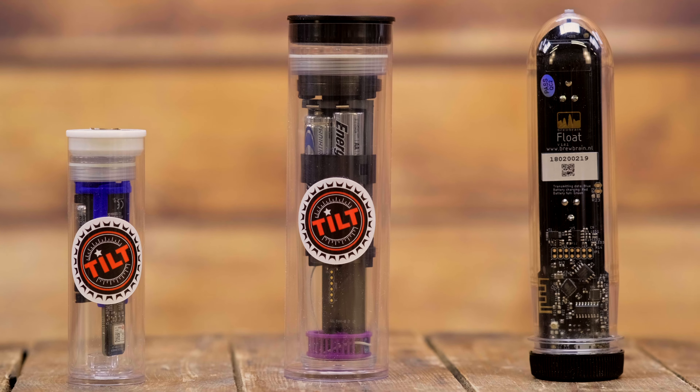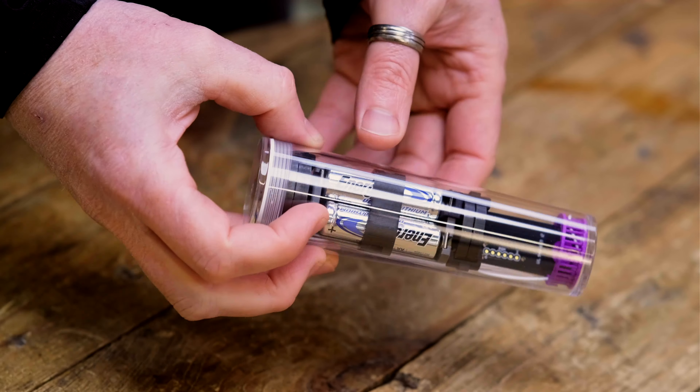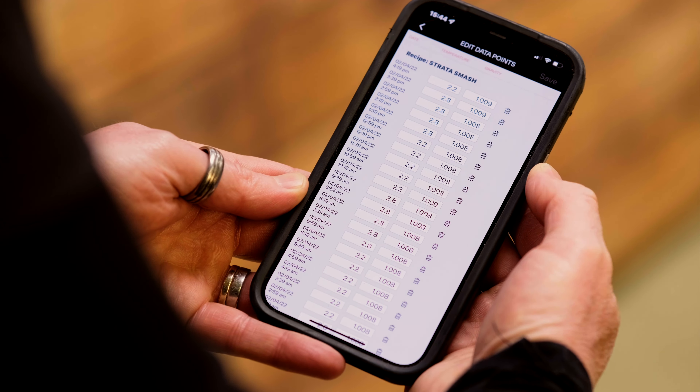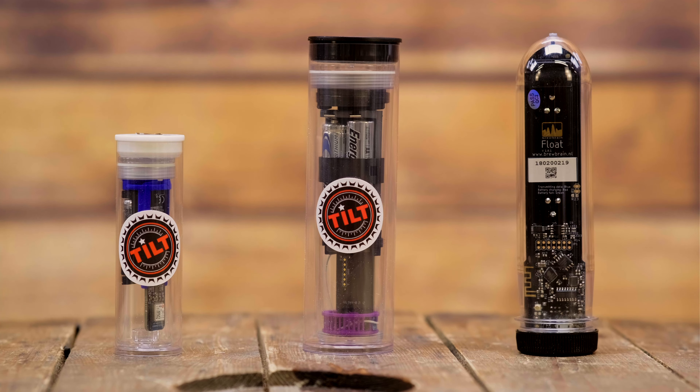Let's take a look at digital hydrometers. They do the same job — measuring the amount of sugar dissolved within a liquid — but these are designed to be put in the fermenter at the start of fermentation and left there for the duration. Different versions have different ways to connect: some work with Wi-Fi, some work with Bluetooth, and indeed some can work with both. This gives you remote access to your fermenting wort so you can track exactly what it's doing at any one point. Another advantage is they give you the temperature of the wort as well as the gravity reading, and they'll tell you when fermentation started, when it's slowed down, when it's finished, and the temperature graph right throughout the whole of the fermentation.